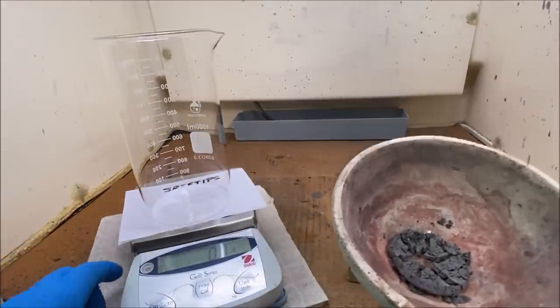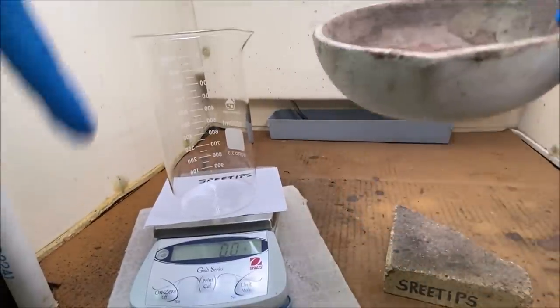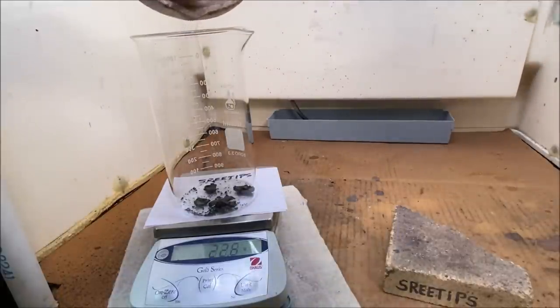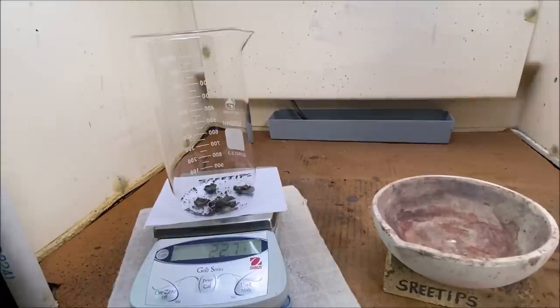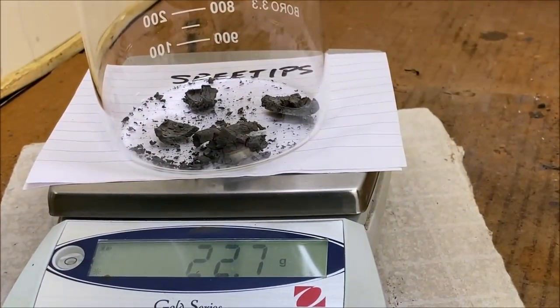I've got the beaker. Let's see if we can find that. See that number down there? We've got the beaker sitting on a scale. It's zeroed out. Now we're going to add the solids to our beaker. That's pretty solid sounding. Got 22.7 grams of material in there. It's a little bit more than I was expecting.